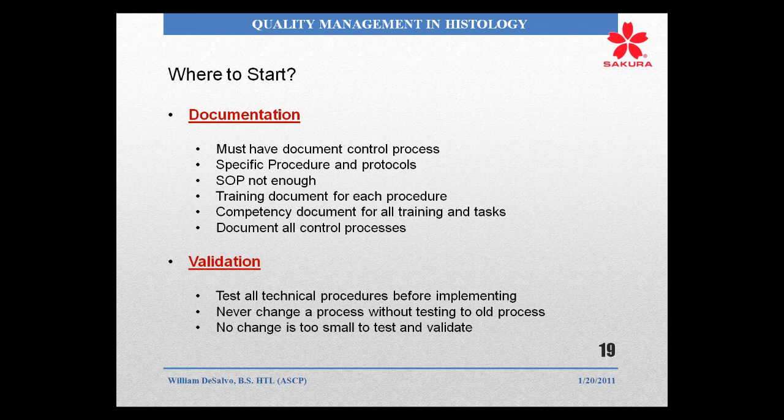After you write your SOP, by creating that training documentation for the procedure, a lot of times that will lead you to go back and correct or adjust your SOP before you even put it out. And then there's competency documentation. It's the next step in quality management: you write an SOP, somebody reads it. I'm pretty sure that's happening in almost all of our labs. Maybe you use a mentor.